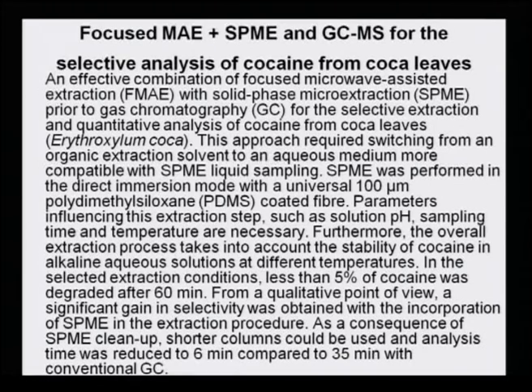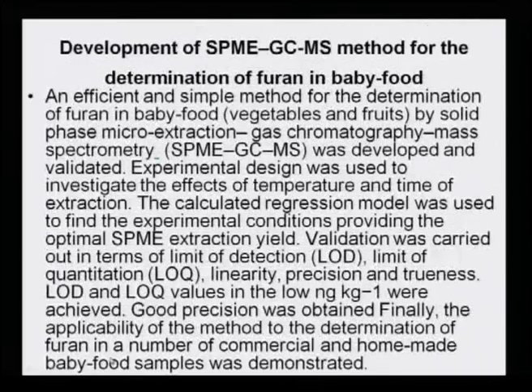For the selective analysis of cocaine from coca leaves, an effective combination of focused microwave-assisted extraction with solid phase microextraction and then GCMS of the cocaine from coca leaves has been done in order to get very good results as compared to the conventional methods.